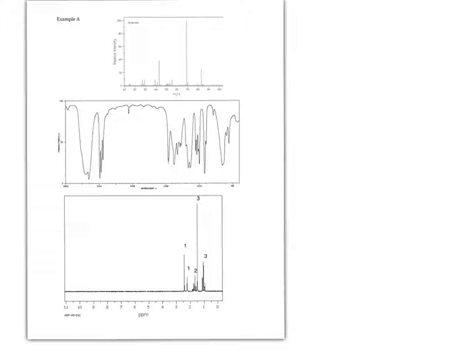First in a series on how to solve mixed spectra problems, also as done in class. We don't have to, but it's short and sweet, so let's start with the mass spec. And we want to look closely, although even at this scale I can see that right around here, that's where our molecular weight is likely to be.